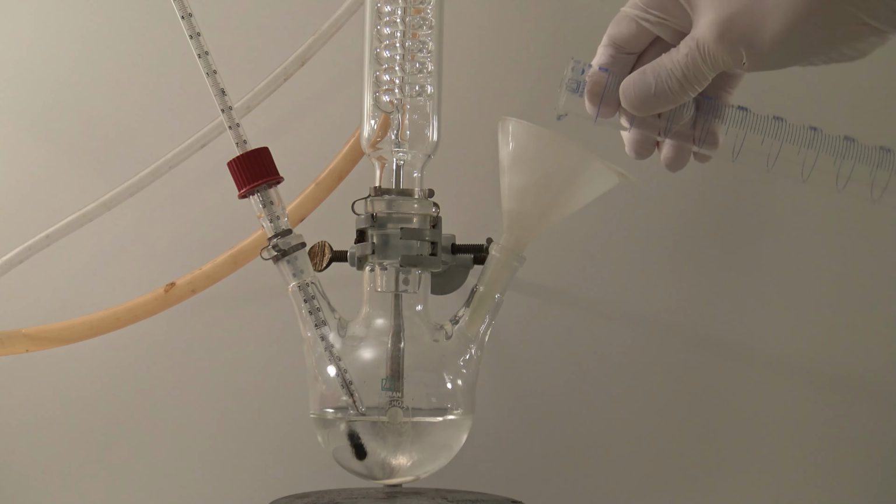Then 14.7 grams of ice-cold acetaldehyde were added. This has a boiling point of 20.2 degrees C, which is why even opening the container at room temperature can cause a flash boil.